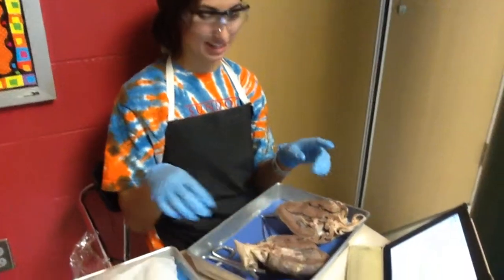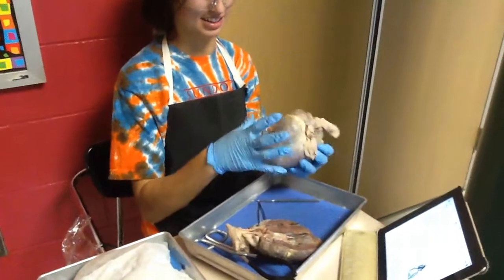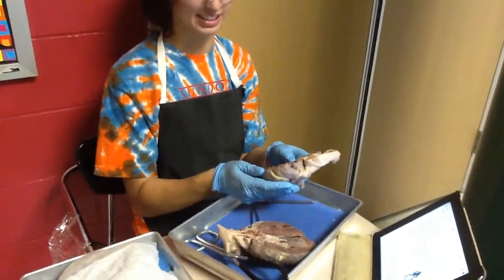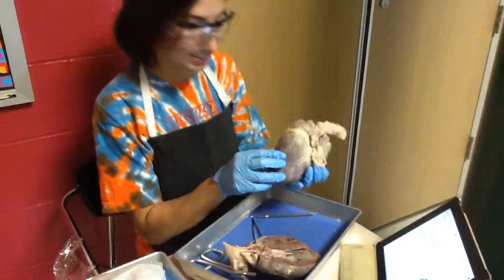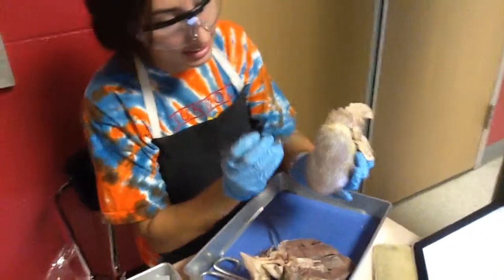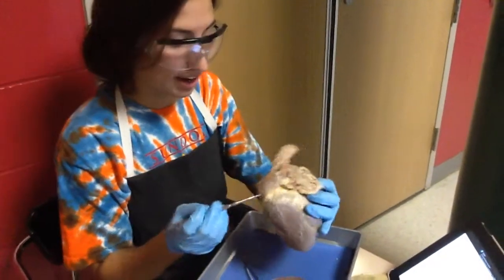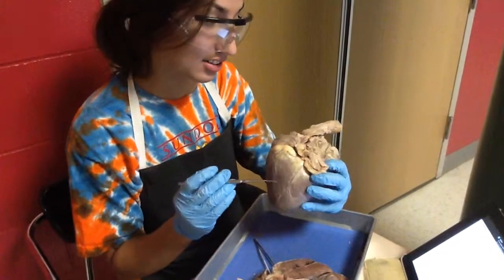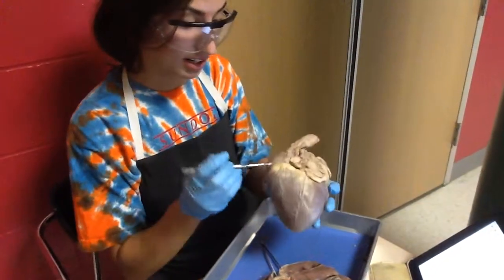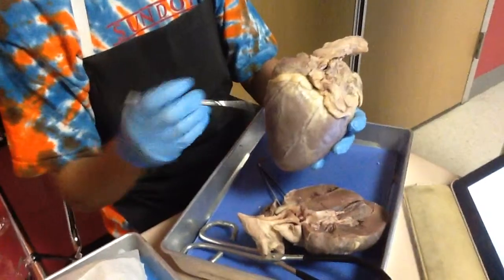Alright, so before we began, we cut off the fibrous pericardium, and that is the coating that holds the heart and everything together. Then the next thing on here is this layer right here, the visceral pericardium. In the visceral pericardium, we have the coronary blood vessels and the cardiac vessels. Then right here we have adipose tissue, which is just fat on the heart.